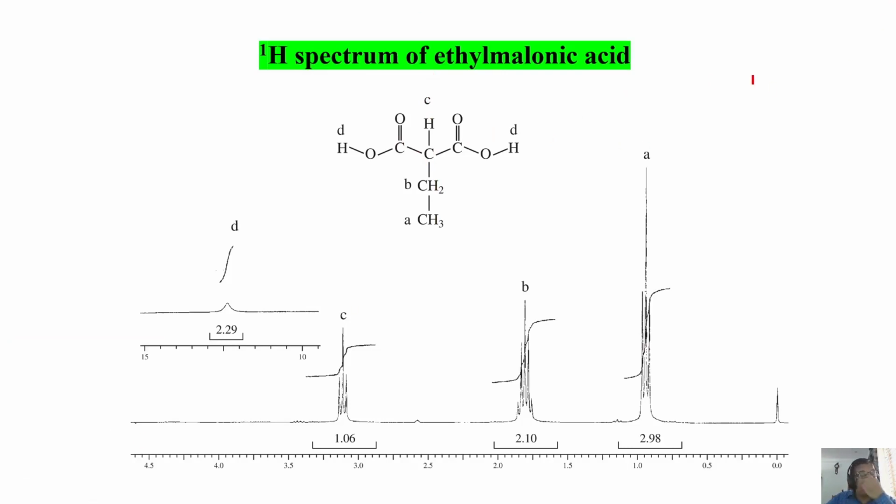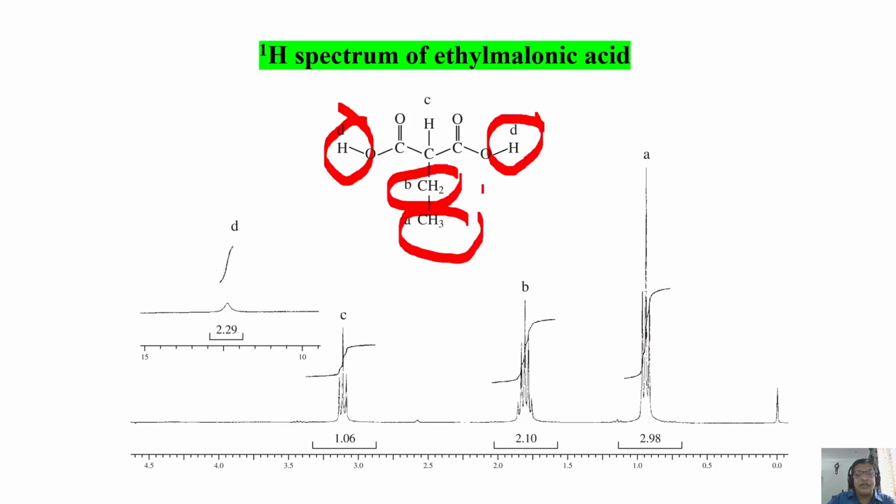How many different chemically inequivalent protons are there? This is equal to this. There is one type. And this is one, 3, and this is 1. There are only 4 types of protons available in this molecule, which are chemically inequivalent. How to analyze that? Very simple. Please look at this one. How do you analyze this one? This CH3 group and CH2 group, very common.